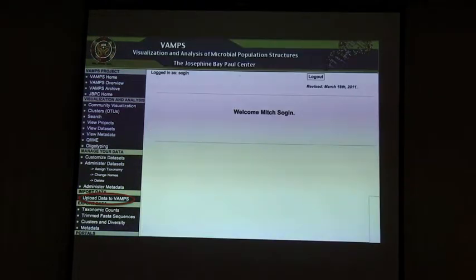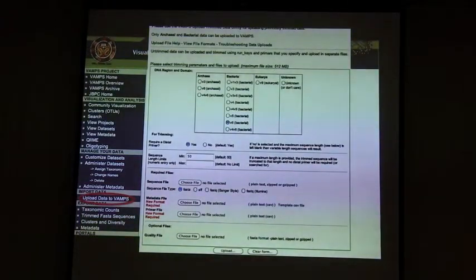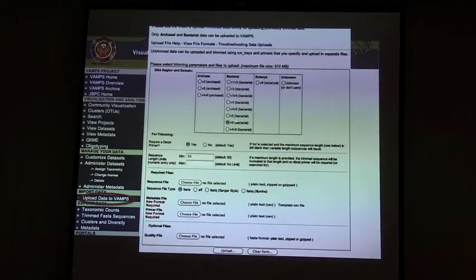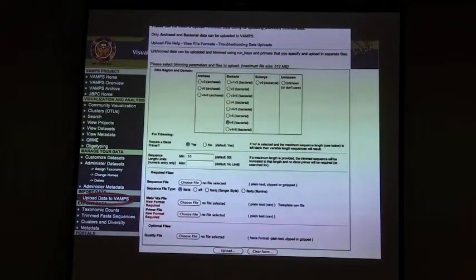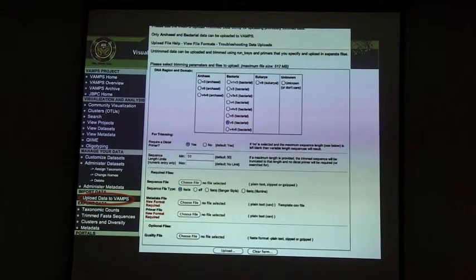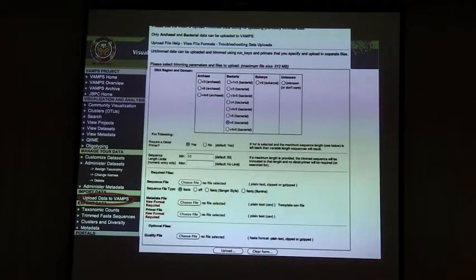We're supporting, at the moment, a number of different hypervariable regions, either in bacteria or archaea. We're supporting V9 sequences in eukaryotes. And then you have various parameters, and you can upload these data in a variety of ways that range from being FASTA or FASTQ, or I think SFF files are uploading if you can get the data to us. They tend to be larger.